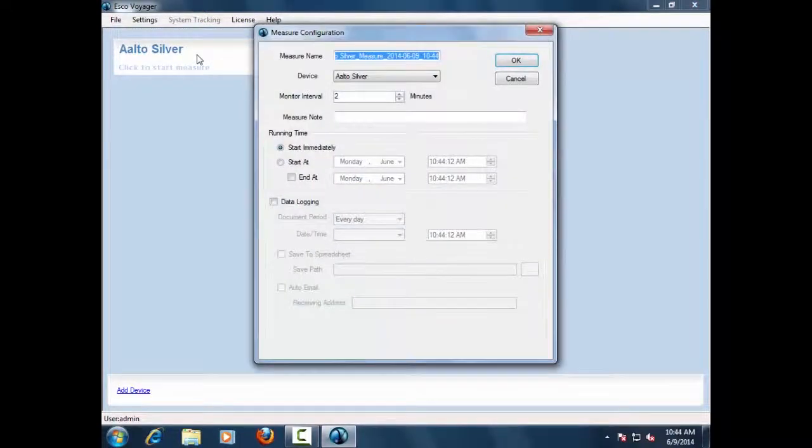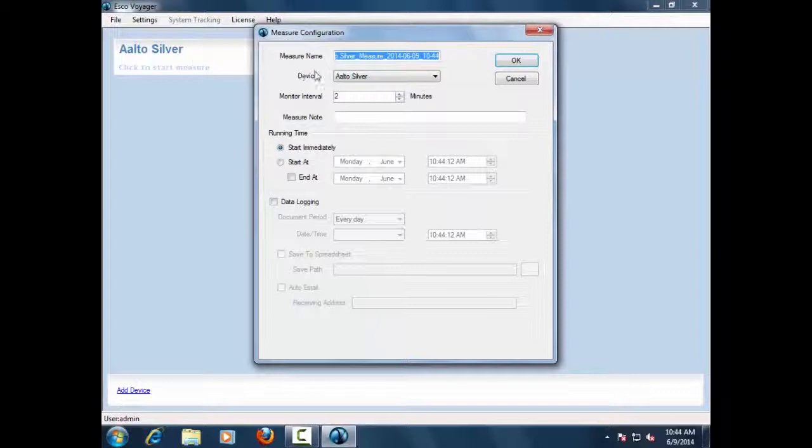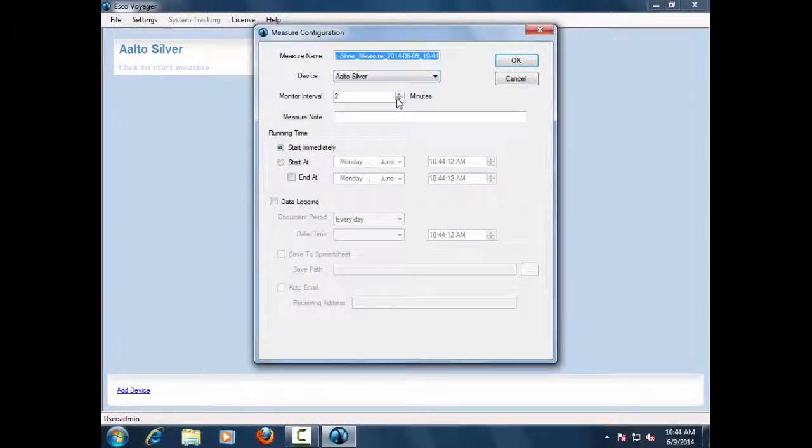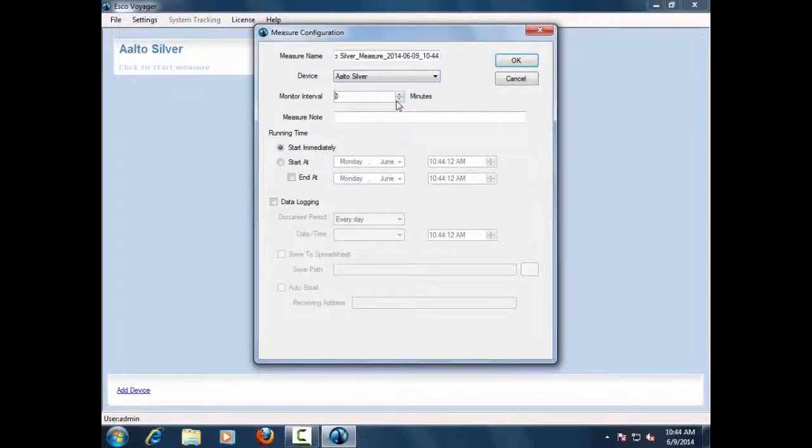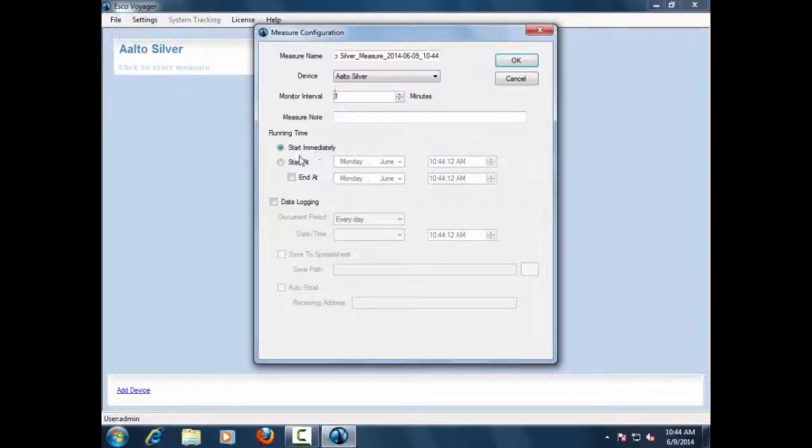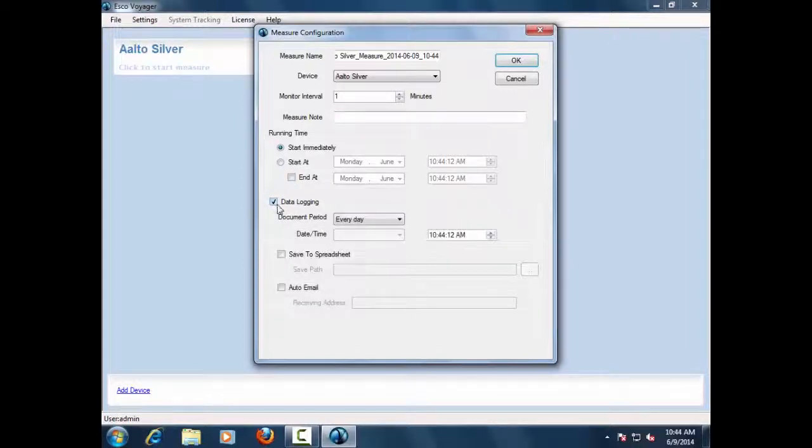Before starting measurement, the user is given options to configure different parameters, such as interval monitoring units, set up running time to start immediately or at a particular time, configure data logging period, and save it to a particular path on the user's PC.